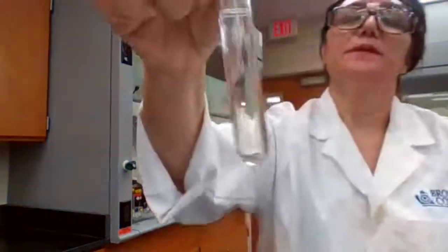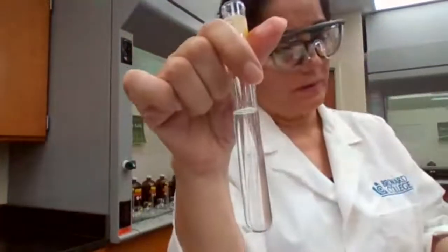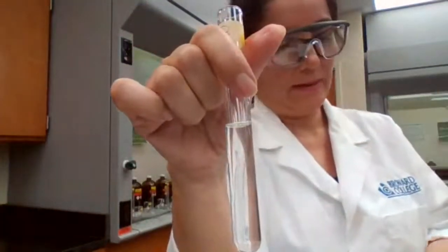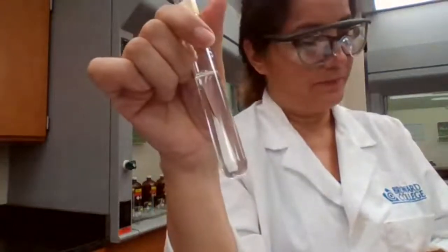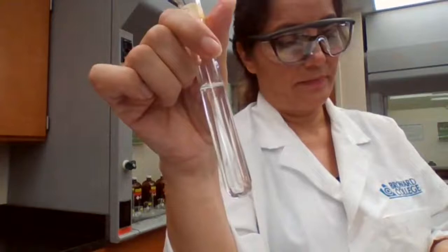Okay, much better. Different test tube. Record your observation. This is just the deionized water. And we are going to add sulfuric acid to this solution.